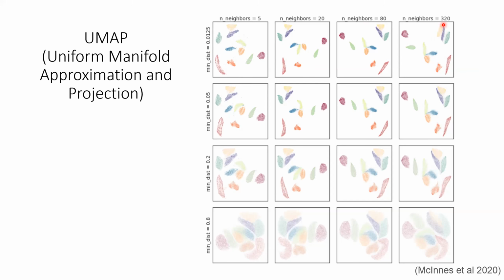So in other words, it's a parameter that modulates the granularity of the projection. Do you want to look at the whole world of neighbors, then you would use a larger K value. But if you only want to look at your local neighborhoods on a street in gene expression space, you would want to use a smaller number of neighbors.